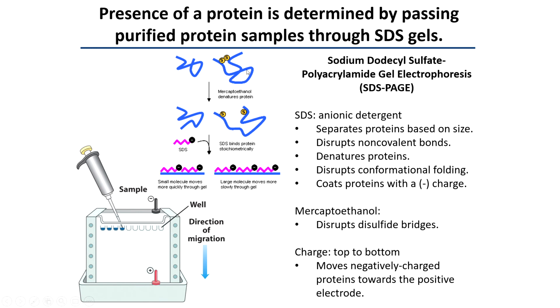So the first thing you have to do in preparing your sample is to add mercaptoethanol. Remember this reagent? This came up during the Anfinsen experiment in video 2-4 when we talked about the chemistry of protein folding and how Anfinsen proved that denatured proteins will spontaneously refold in aqueous solution. So review that video if you can't remember what this is used for. Mercaptoethanol specifically breaks disulfide bonds. So it breaks the disulfide bridges that are formed between cysteine residues on a polypeptide chain.